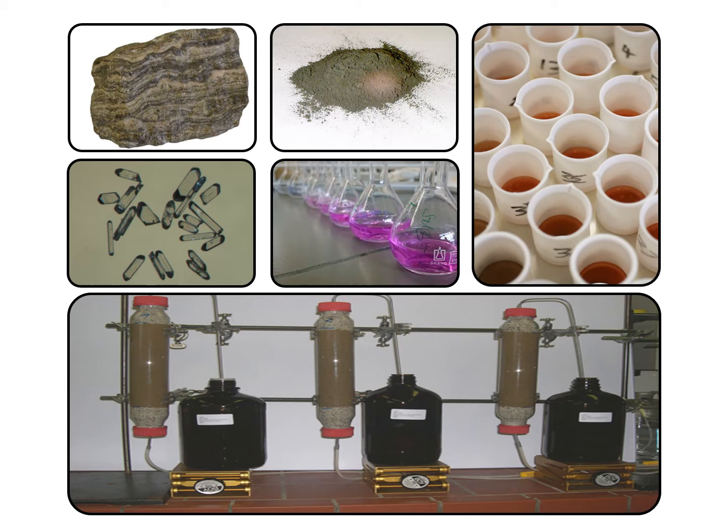You don't have to dissolve the whole sample, so there are a bunch of scientific questions you might want to ask. For instance, this is a series of soils and just leaching those with different reagents. So you're not dissolving the whole thing, but you're dissolving some phase of it. You have to create a solution. There are laser ablation techniques where you don't have to create a solution, but for the bulk of these things, you need to turn your sample from a solid geological thing into a liquid.